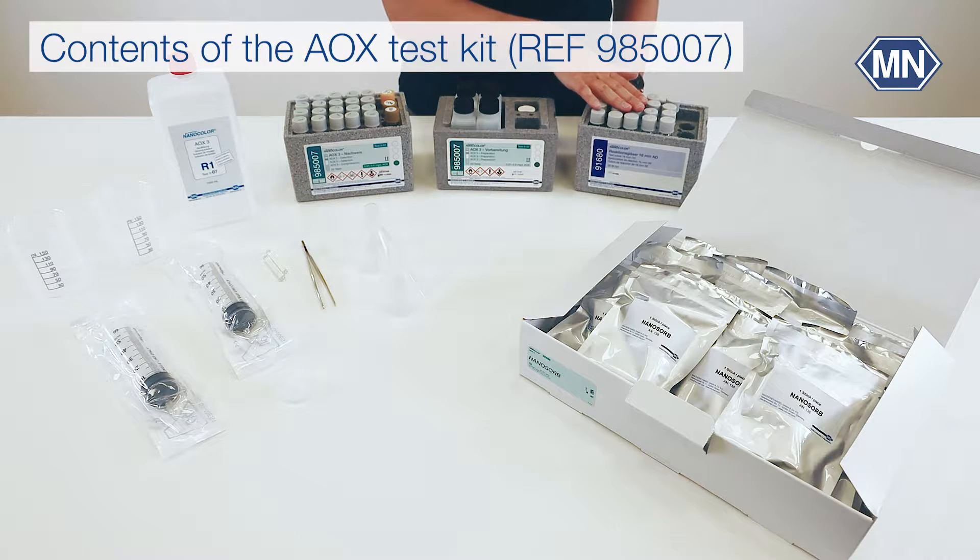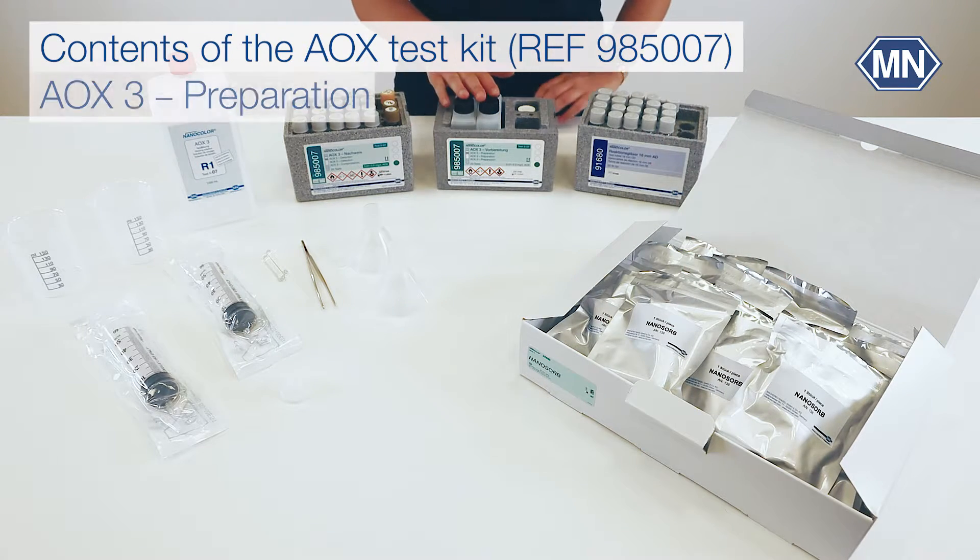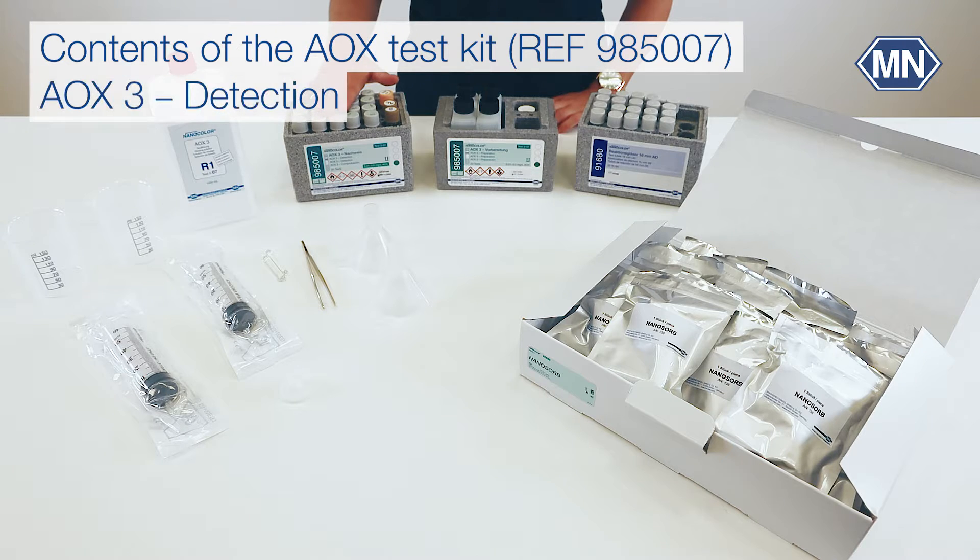The NanoColor AOX kit contains four boxes, sufficient for 20 determinations: a box of empty test tubes, a box with 20 nanosorb cartridges, one box for the preparation, and one for the detection.